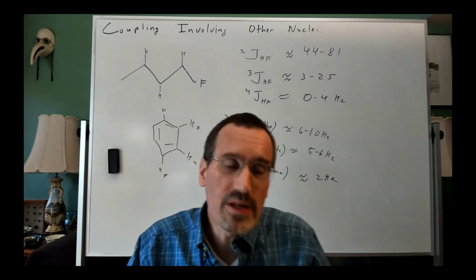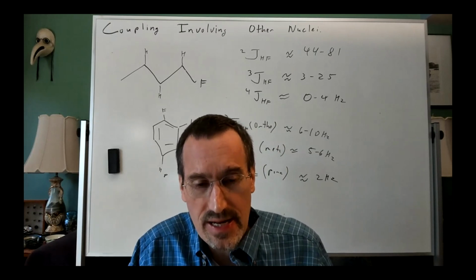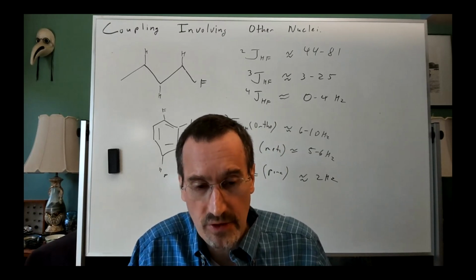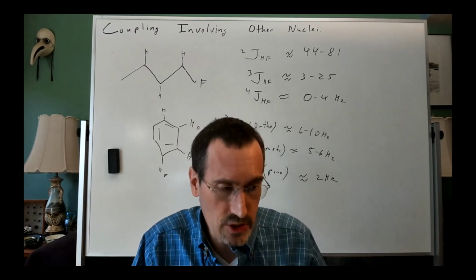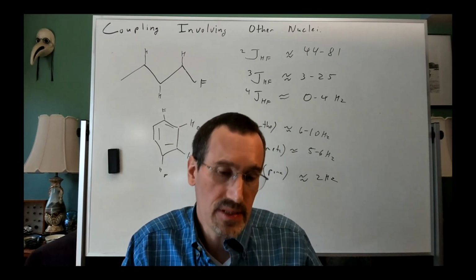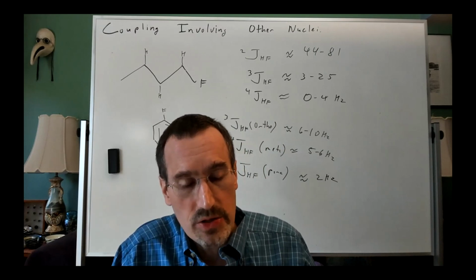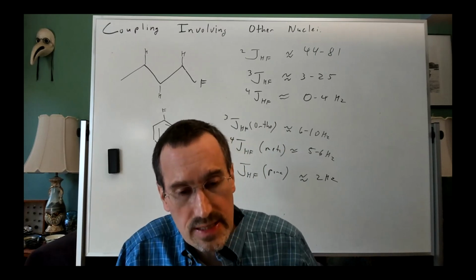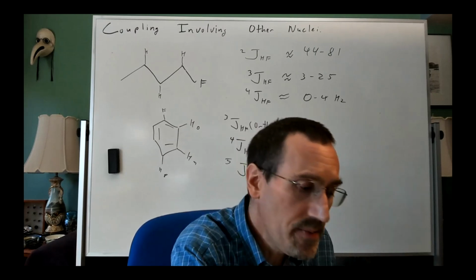If you know that there's a fluorine in the molecule, I would say expect proton fluorine splitting. I guess your question is sort of, if you didn't know what the molecular composition was and you didn't know what a fluorine was, could you tell? And I think we're going to see a couple of examples where the answer would be yes.